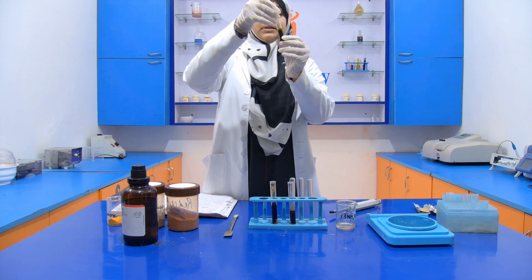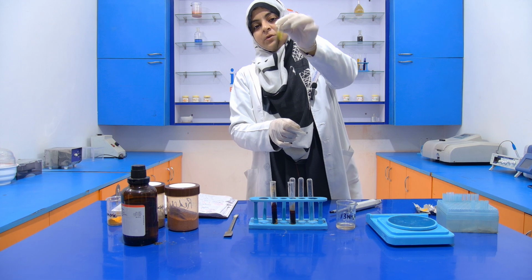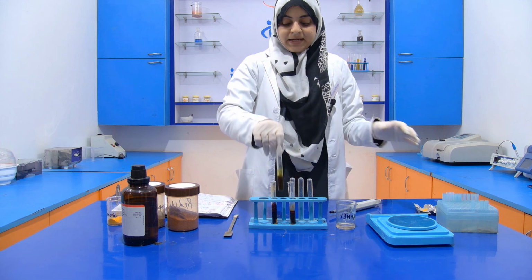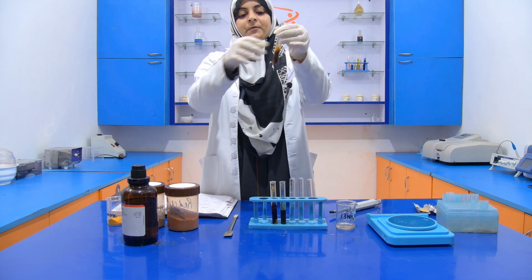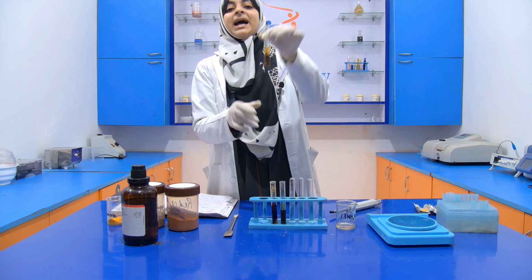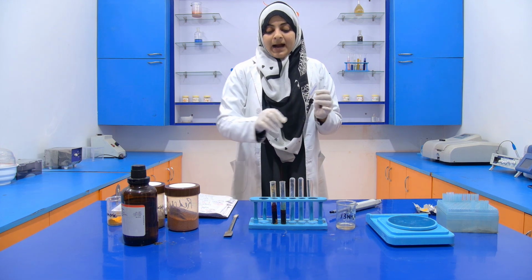Now see the next. Here there is no development of red color, which means that the black pepper is not adulterated with a coloring agent. And the same with the red chili powder, we don't get any red color, which means that this red chili powder is also not adulterated with added color.